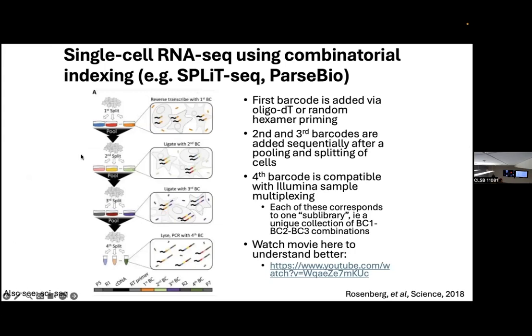So let me talk about some other possible platforms. What I just described is how 10x Genomics works. There's another high throughput method, initially called split-seq, and then they formed a company, and that method and the company is called Parse Biosciences. This method is nice for a few reasons that I'll get into, but it all works in a plate-based setup. Instead of a machine, there's no microfluidics, there's nothing complicated like that. It's instead just crazy complicated at the molecular biology level.